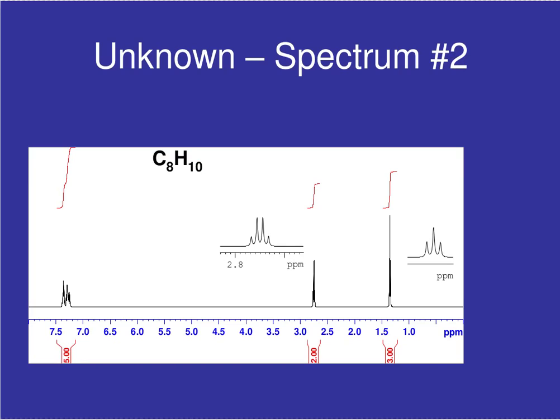Have a look at this case over here. So what I tend to do in these spectra is I tend to zoom in on a signal. So this signal here is expanded over here. So you can see that this one is a quartet. That's what it looks like close up. And this one here has been expanded as well. It is a triplet.